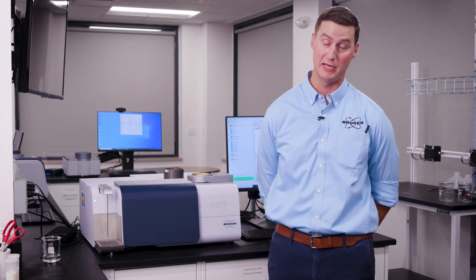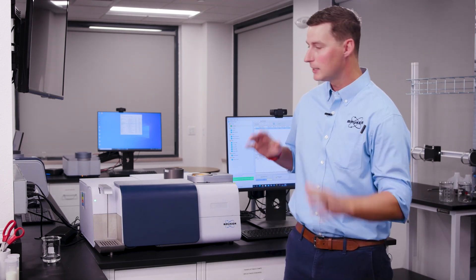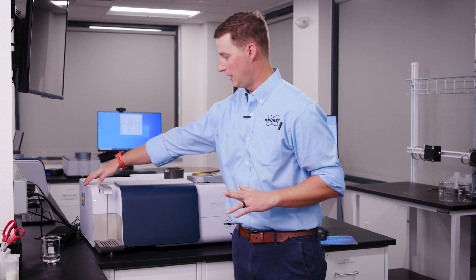Some questions that we often get from customers or potential customers about the system — we're going to go through some of those right now. The first one being cleaning: how cleaning works, how often you need to clean, and whether it's manual or automated.